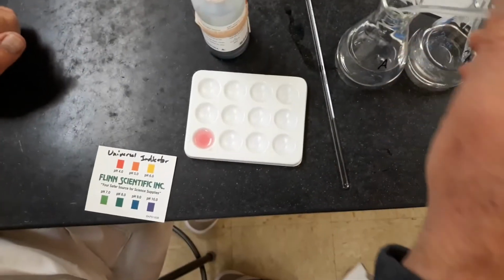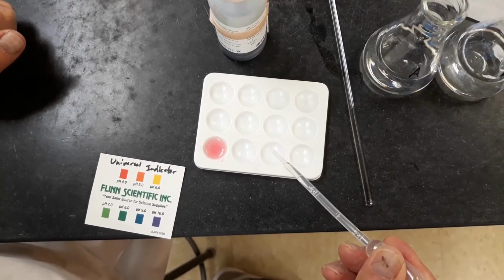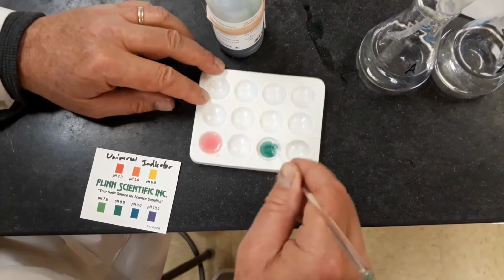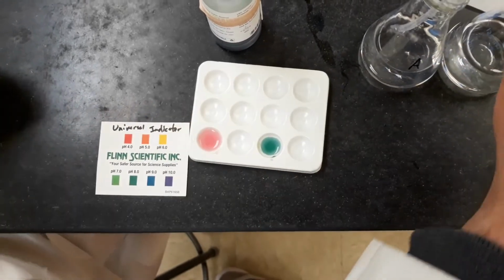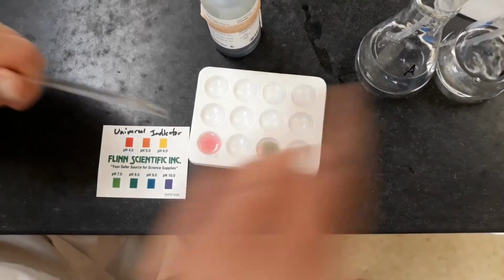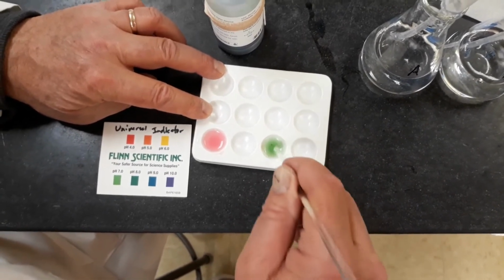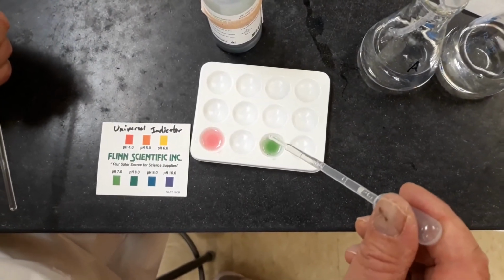All right, so now we're supposed to do the same thing with A and B. Take 5 drops of A, and then a drop of universal indicator. And if you notice the pH range, and then drop by drop, add B. 1. Whoa. Two.